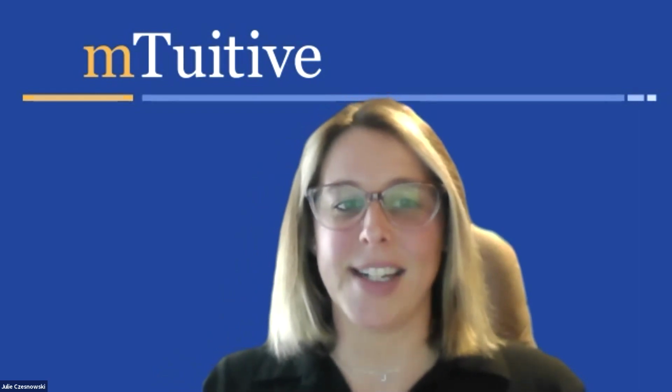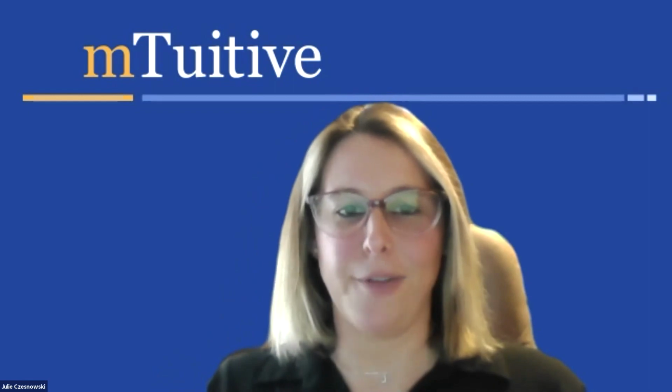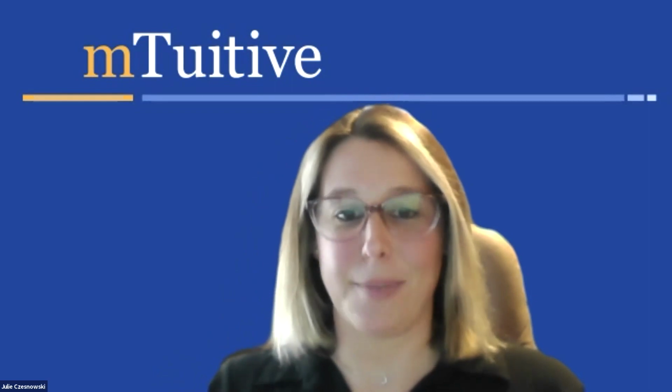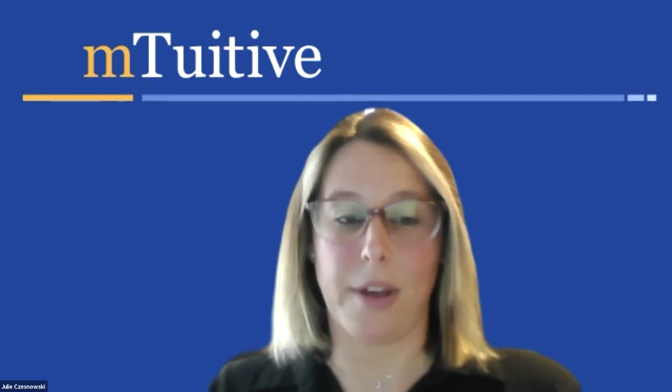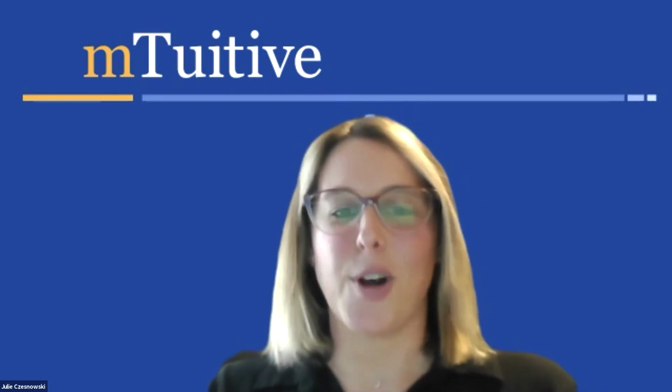Today we're joined by Brigette Rabel, who is the Synoptic Reporting Provincial Coordinator for British Columbia. Her presentation will delve into how discrete data from Pathology Synoptic checklists maintained by mTuitive feeds into BC's own central data repository. With this data, BC has developed individual dashboards for pathologists and surgeons to display a set of quality metrics specific to their practices and allows them to compare results amongst their facility, health authority, and within the province as a whole. This presentation will also be followed by a Q&A session with a panel of experts.